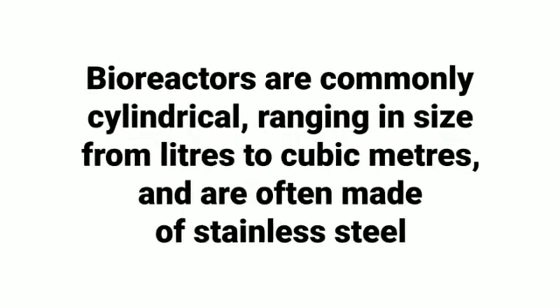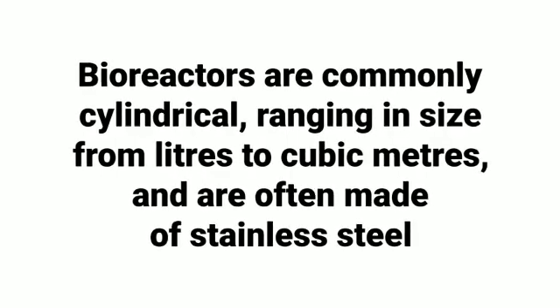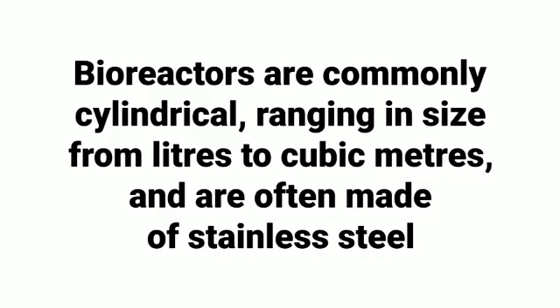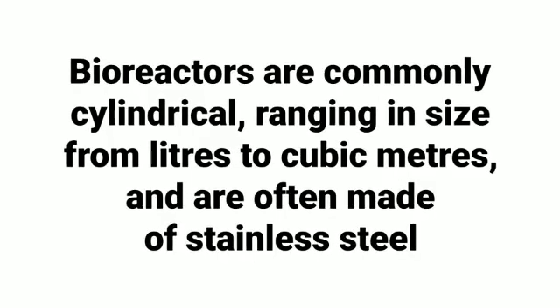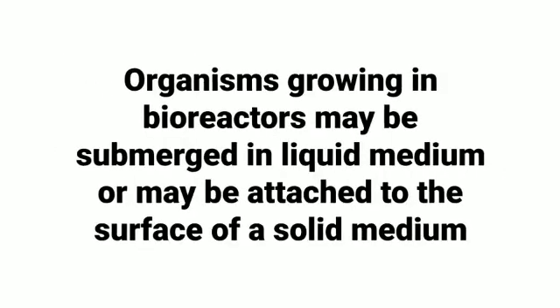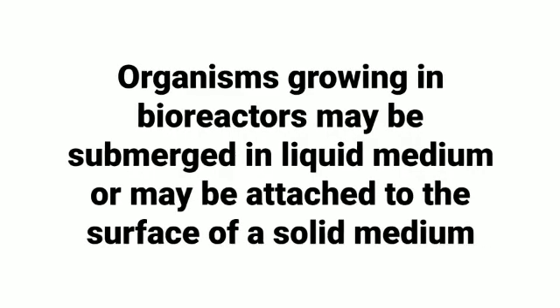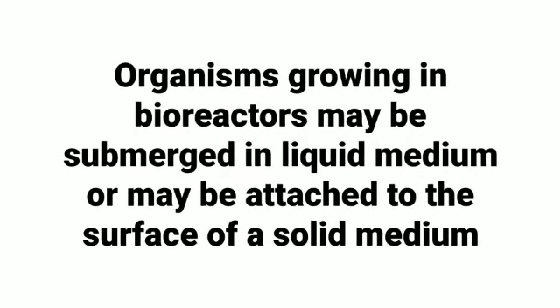Bioreactors are commonly cylindrical, ranging in size from liters to cubic meters, and are often made of stainless steel. Organisms growing in bioreactors may be submerged in liquid medium or may be attached to the surface of a solid medium.